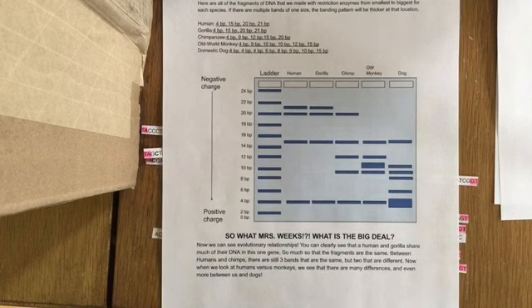In your lab next class, you guys are going to be looking at this with some DNA from penguins and zoos. So you're actually going to be looking at their DNA and making one of these banding patterns. So I hope you understand how gel electrophoresis actually works a little bit better.